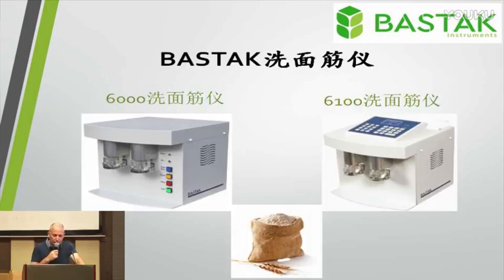There are two kinds of gluten washer. The first one is a little bit simpler than the other, the 6000 model. The other one is a little bit more complicated, which is the 6100 model.